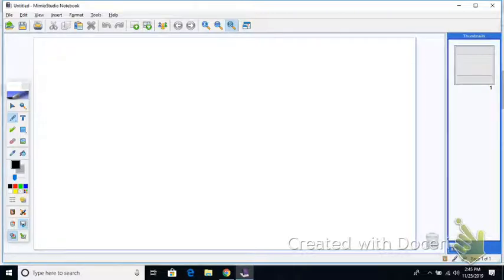On the outside is going to be a hot water bath. You're going to put it in a boiling hot water bath, and it's going to cause the liquid inside here to turn to a vapor. Okay, so it's going to turn into a vapor. You're going to leave it in there, give it a long enough time, so it goes from the liquid to the gas, and it's all a gas.